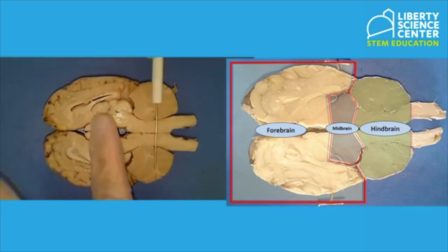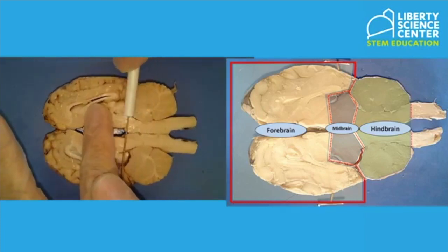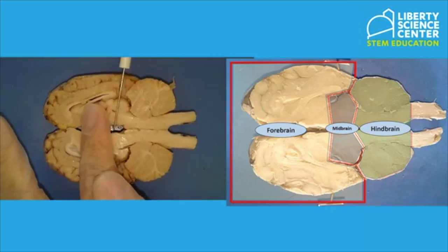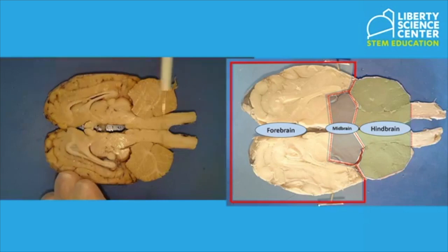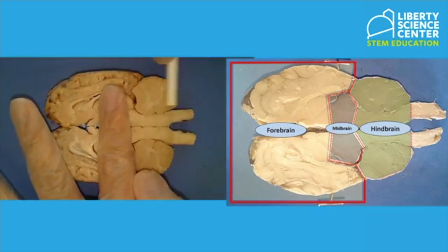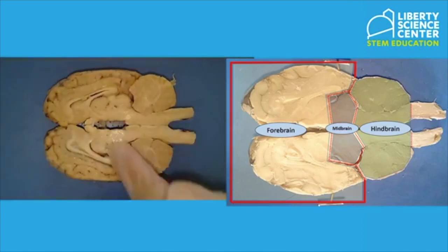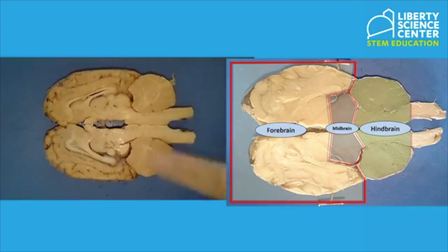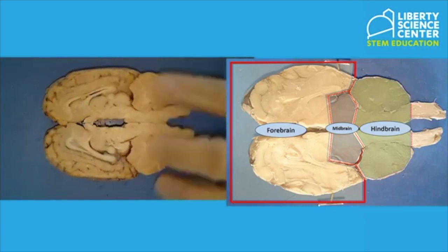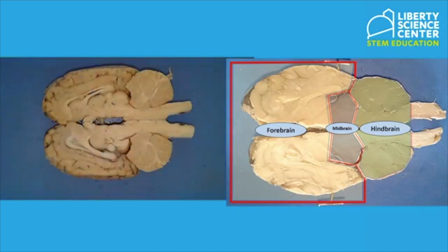The next thing we have is the midbrain. I'm going to do my best to isolate it here. The midbrain is right here. It's the region that connects the forebrain to what we call the hindbrain, which is this back portion of the brain. So we've got forebrain, midbrain, hindbrain. The hindbrain houses the medulla, the pons, and the cerebellum. The forebrain houses all the other major structures.